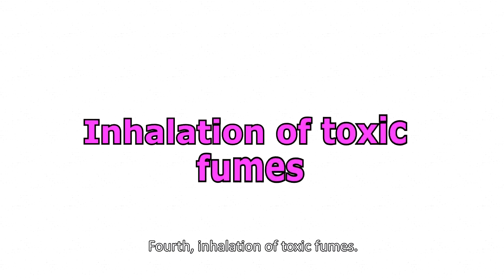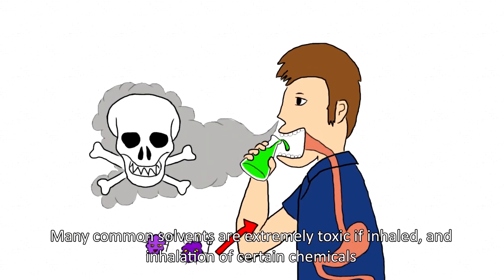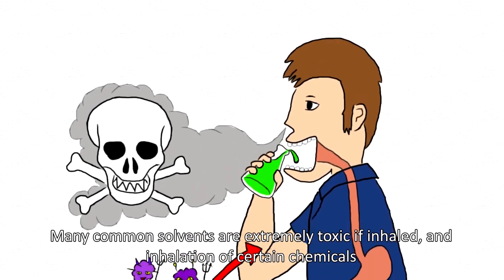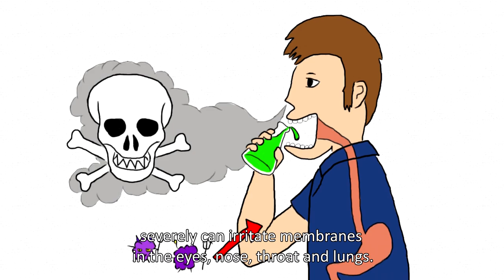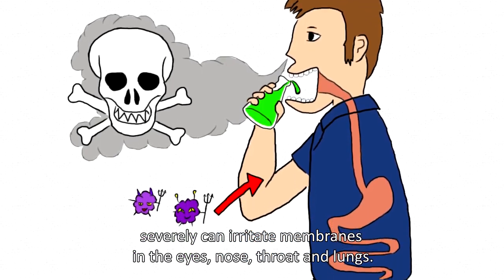Fourth, inhalation of toxic fumes. Many common solvents are extremely toxic if inhaled, and inhalation of certain chemicals can severely irritate membranes in the eyes, nose, throat, and lungs.